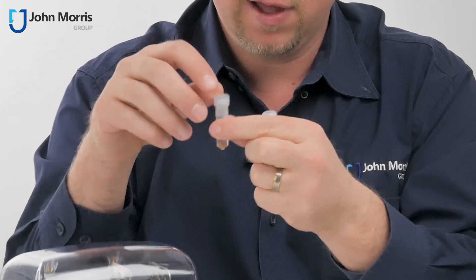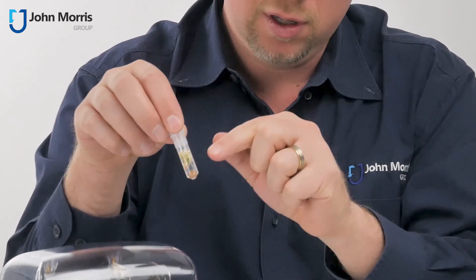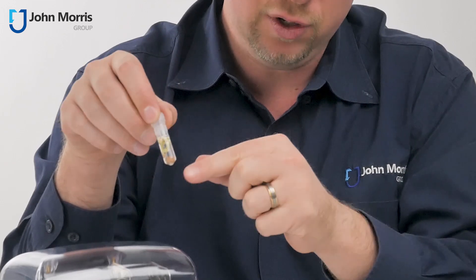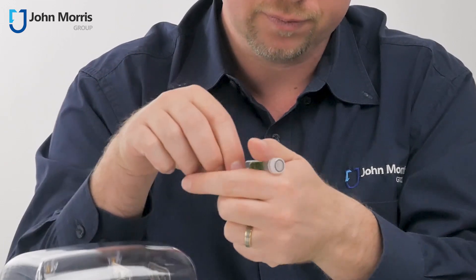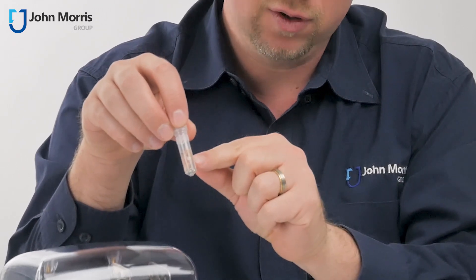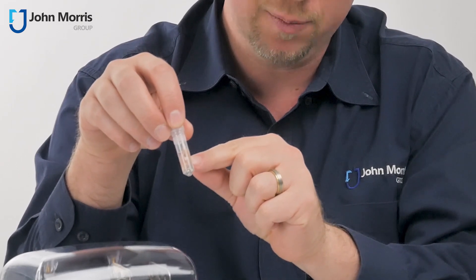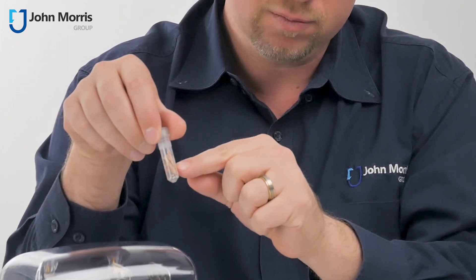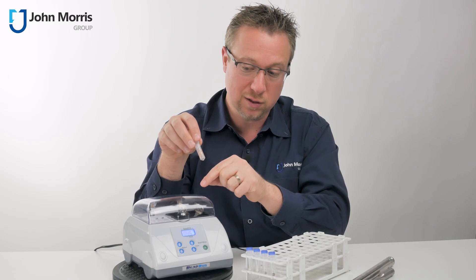Here we have a particularly complex sample. This is literally a part of a tree with the flowers at the end and you can see here the bead at the bottom. And here we have a piece of salami courtesy of one of the pizzas from our team upstairs. Now that's got fat, it's got skin, it's got a range of other things.